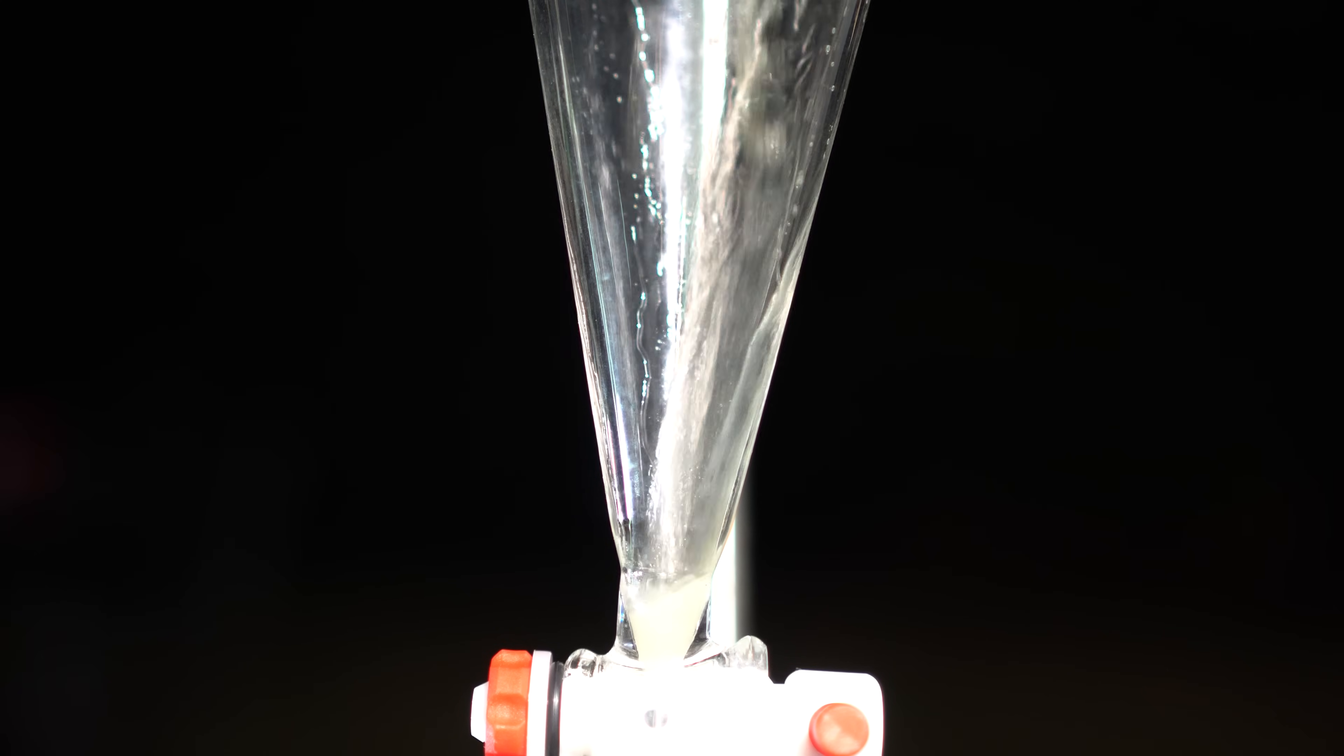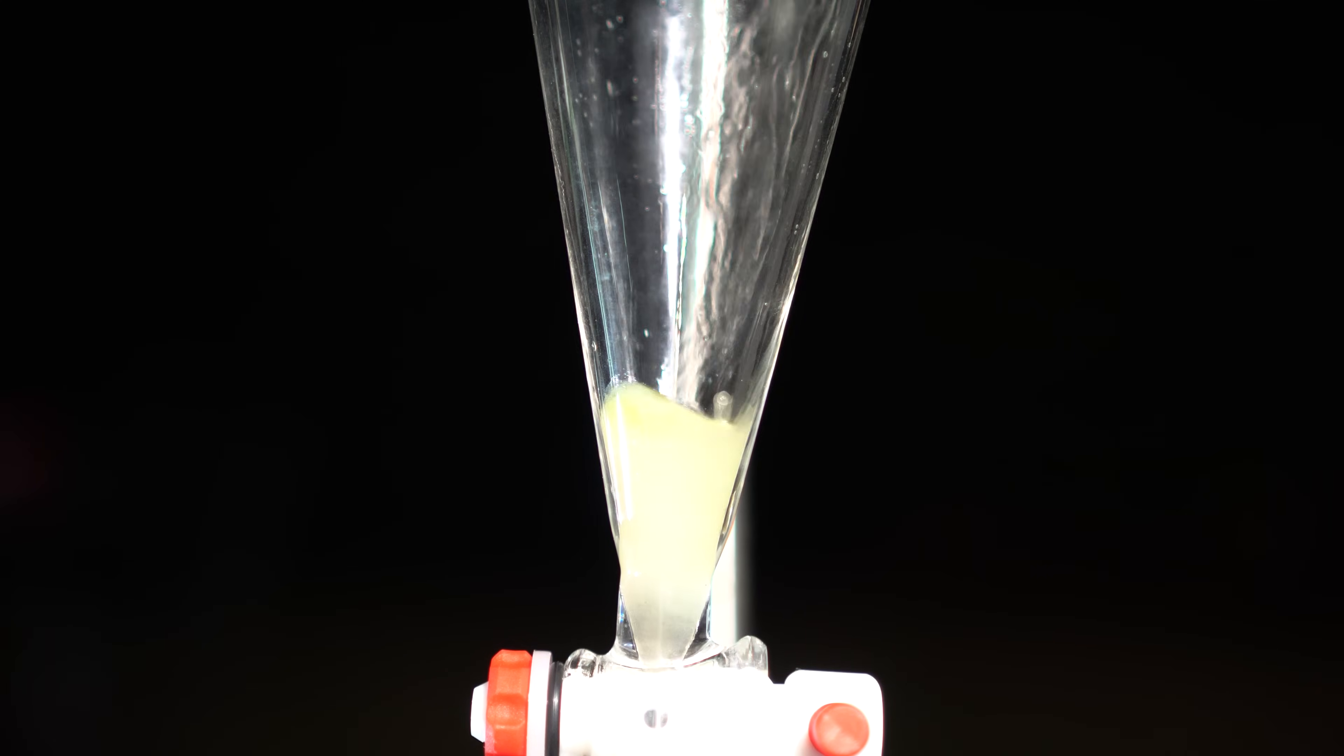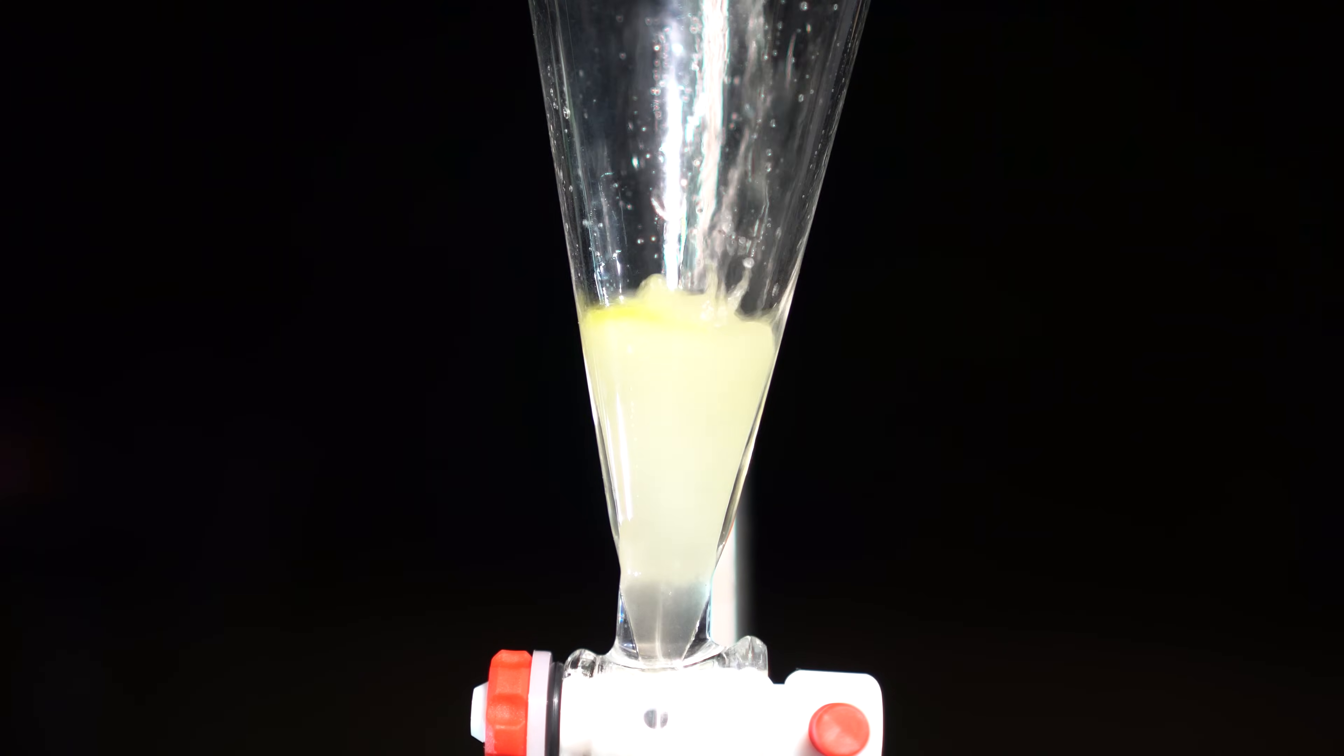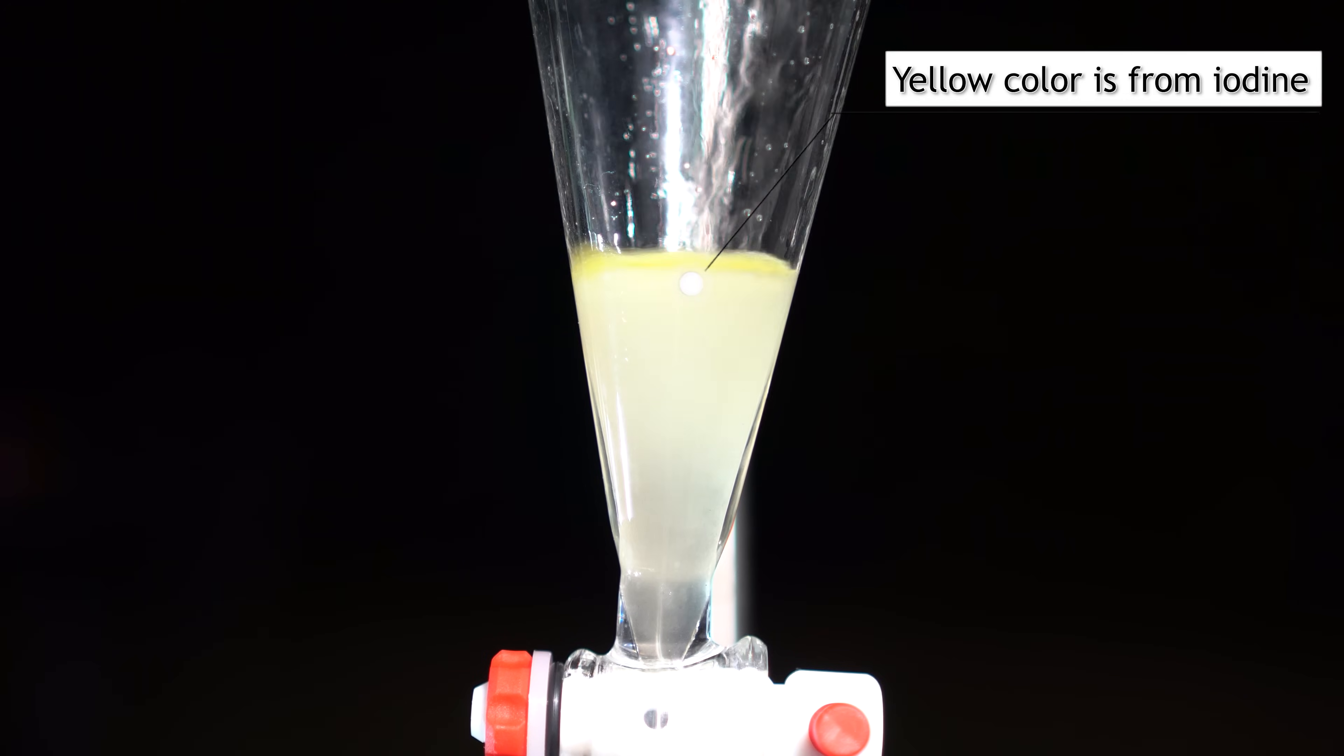I poured everything that was in the receiving flask into a separatory funnel, and we can see that there are two separate layers. The bottom iodomethane layer is cloudy, and the top layer, which I suspect to be water, is slightly yellow.